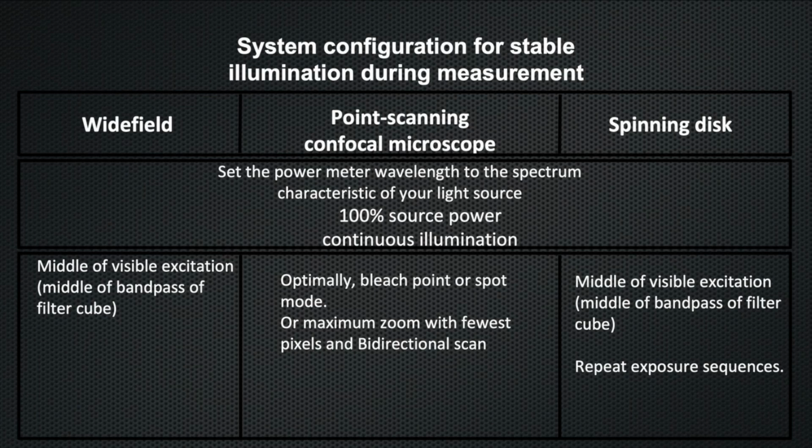The last measurement is the mid-term monitoring. The aim is to measure laser variations over a period of a few hours to highlight any type of direct or indirect fluctuations in laser power.